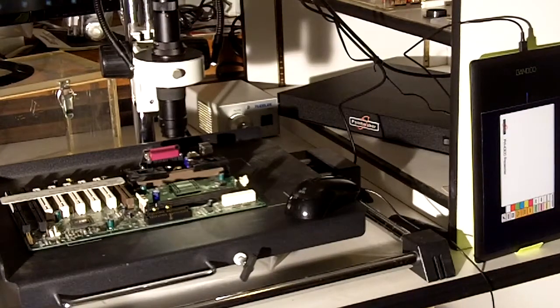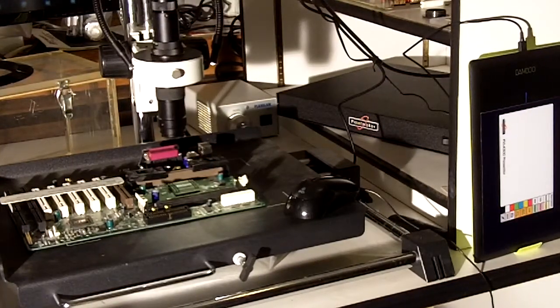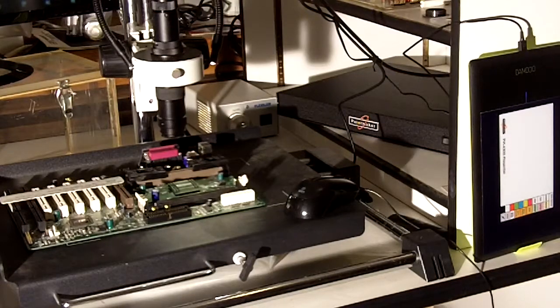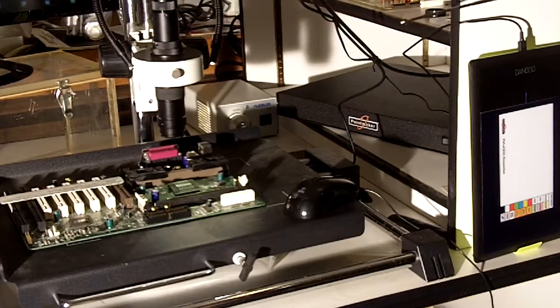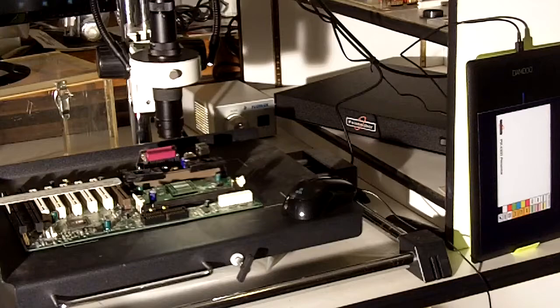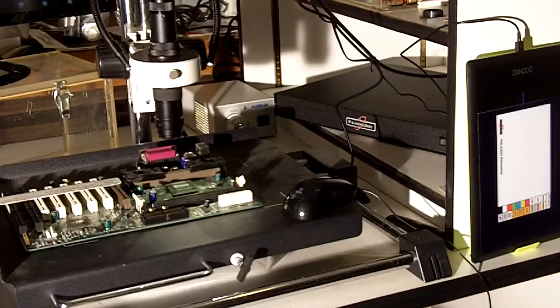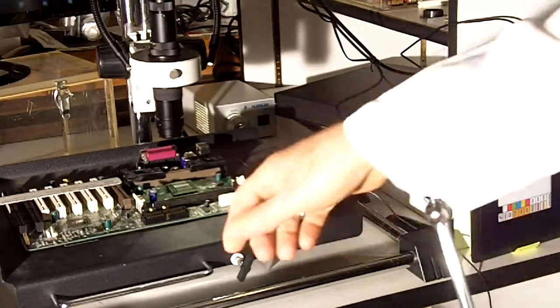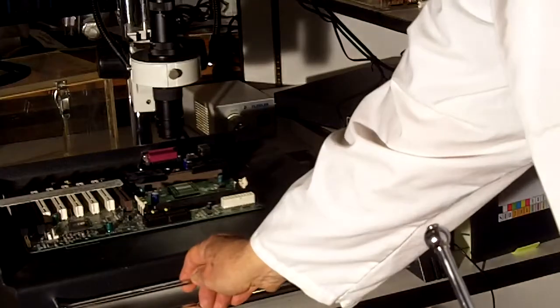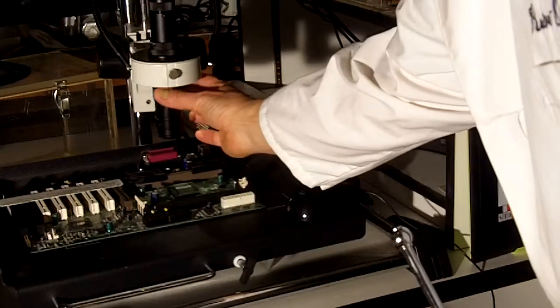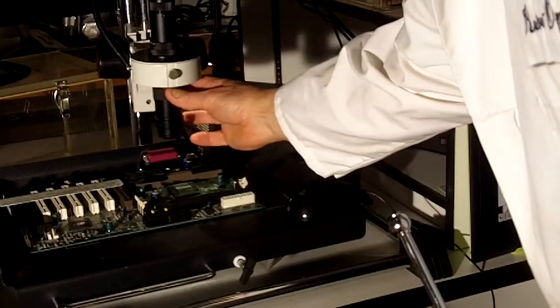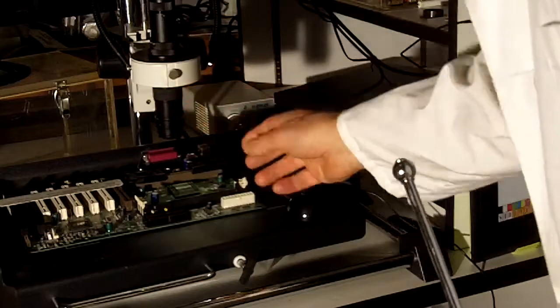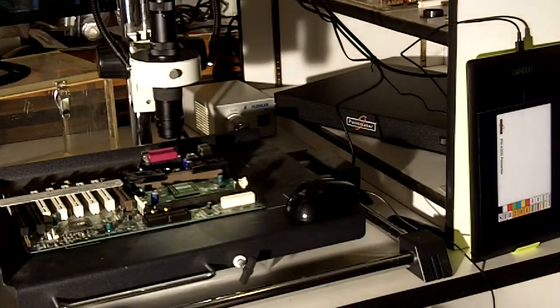This is a USA made product that allows us to take the camera signal, run it through the black box and then out of the black box to the displayer. And of course this is all zoomed so you can quickly zoom in and out on the features that you want.